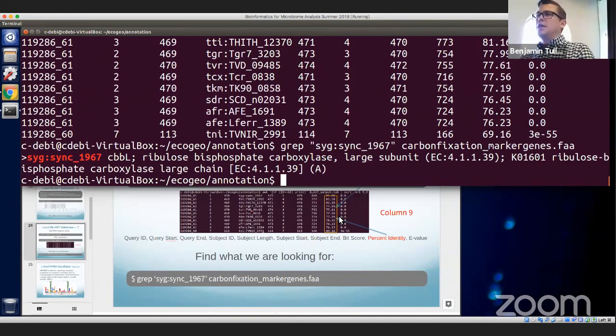And so this is something that you can do obviously on your own with whatever function of interest you want. If you're interested in arsenate, iron, or nitrogen, you can have these little databases that you've made that you know are 100% accurate, or 80% or 90% accurate, depending on how much time you want to put into it, and then use them to search anything new that you come along really quickly, right? You don't have to wait for that big data set to come back.